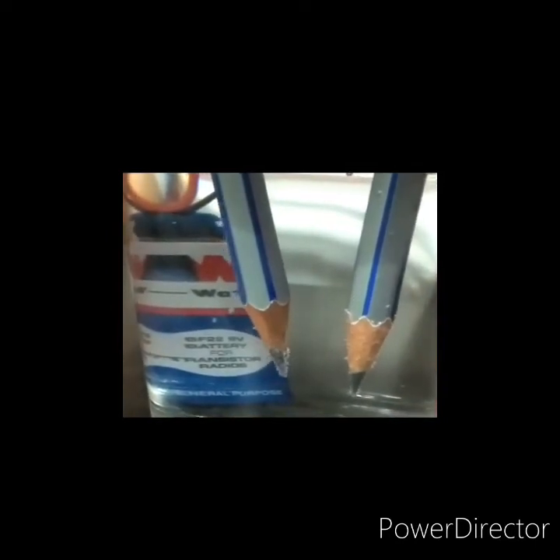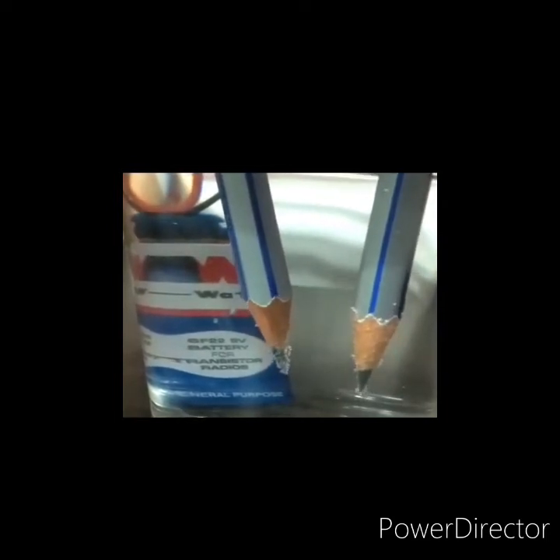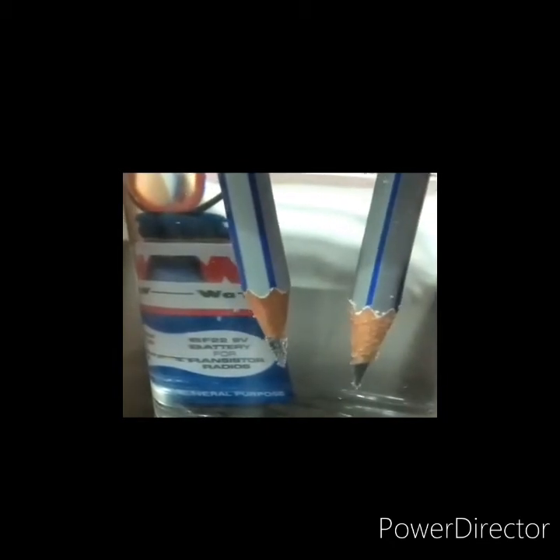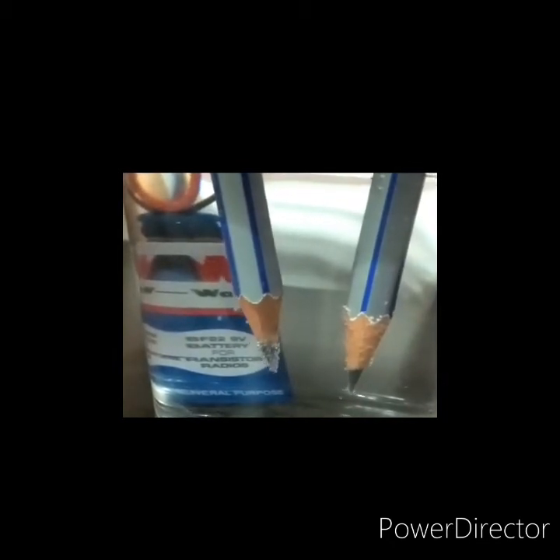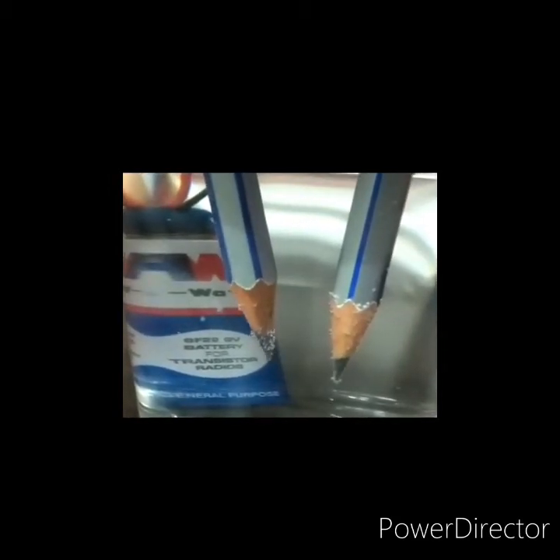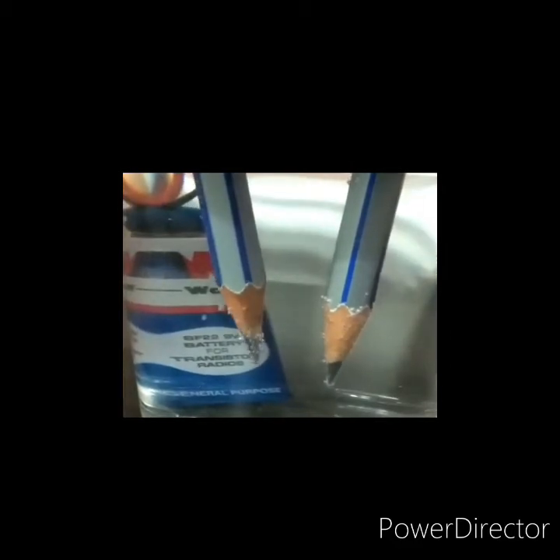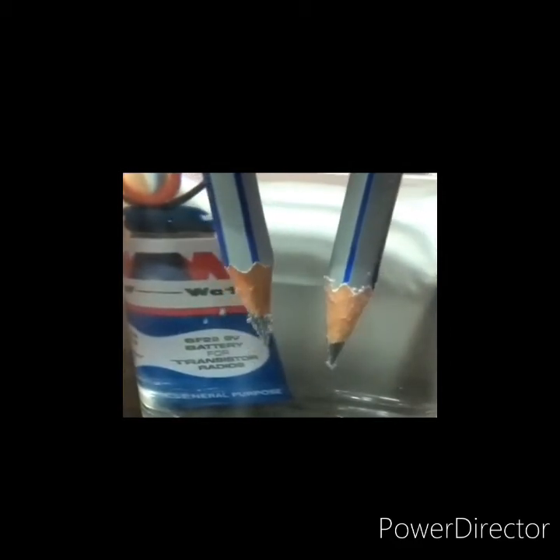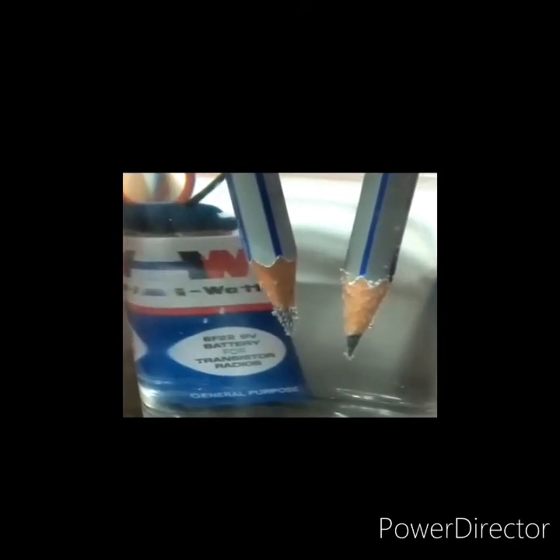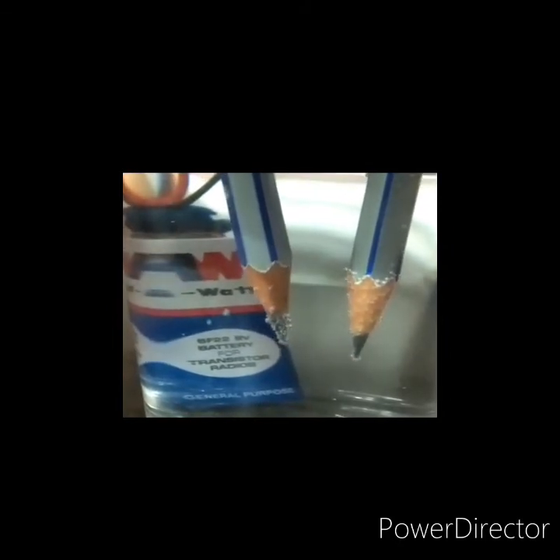Here you can slowly see the bubbles arising. On the right side you can see the bubbles are more compared to the left side. On the right side it's the hydrogen gas evolved and on the left side it's the oxygen gas evolved. You can see more and more bubbles rising as the electric current is passed. Hydrogen gas evolves more compared to oxygen because each molecule of water, H2O, contains two atoms of hydrogen and one atom of oxygen.